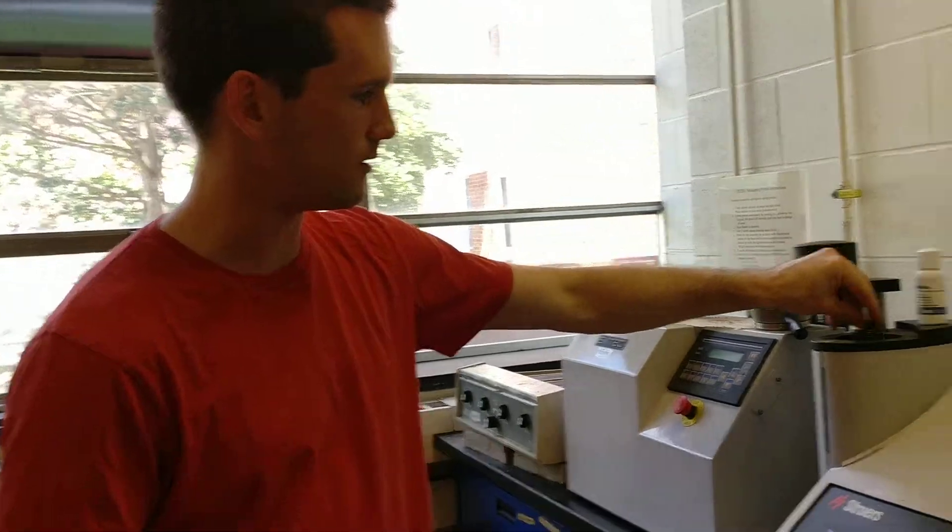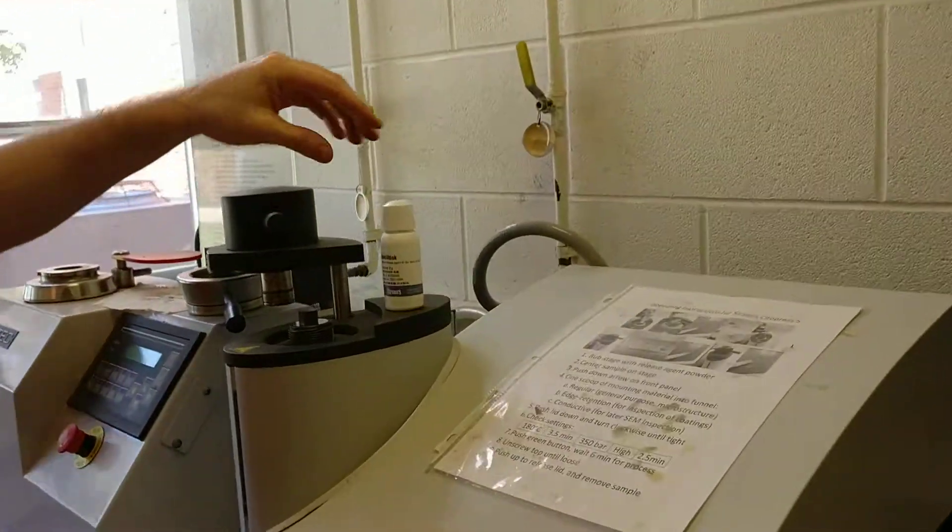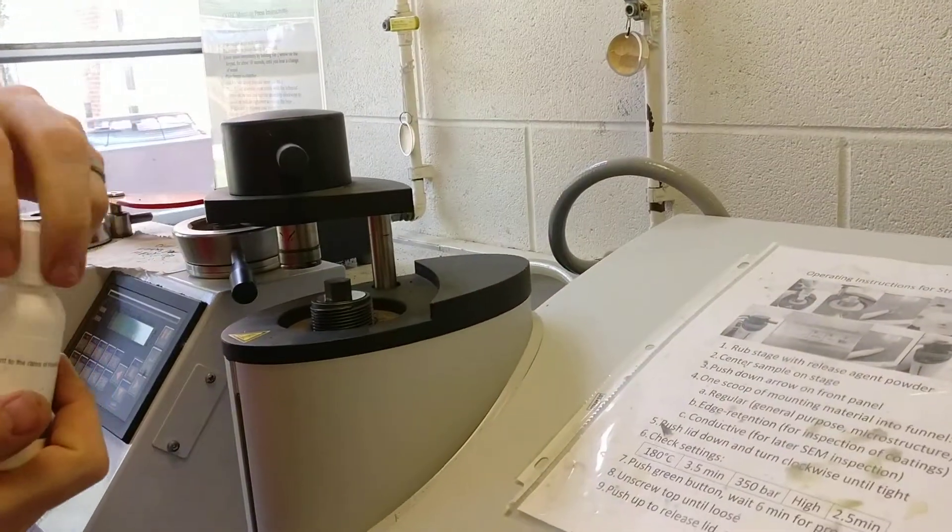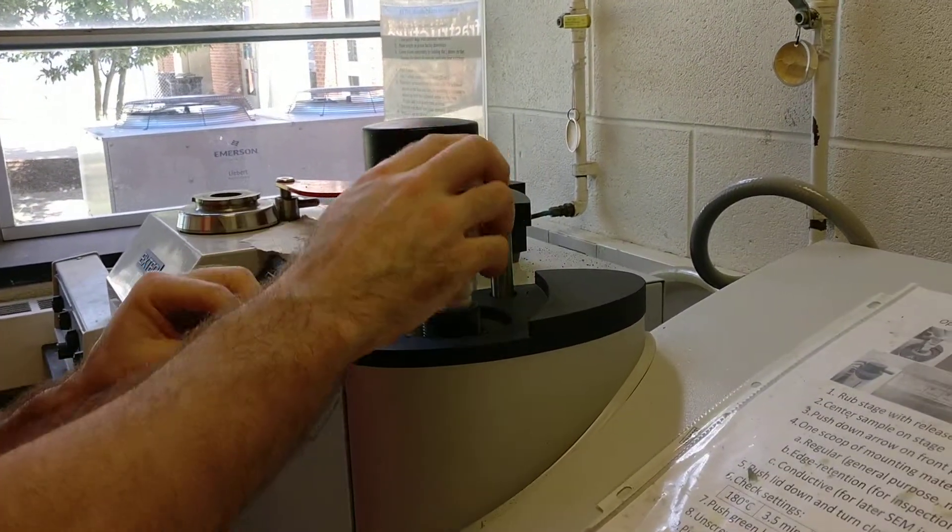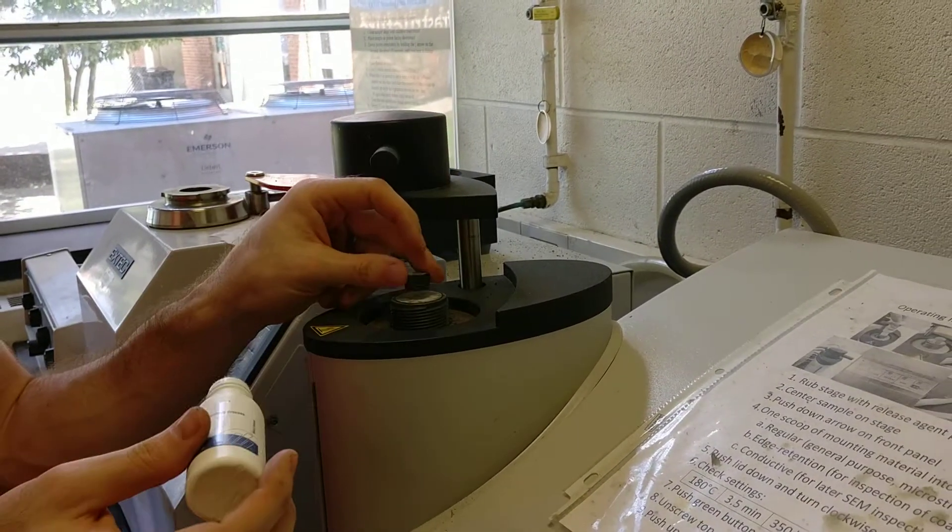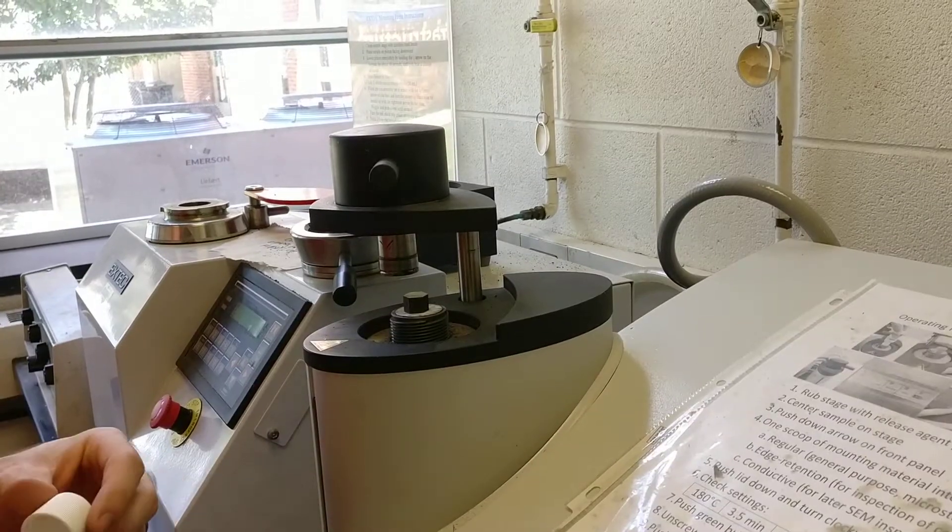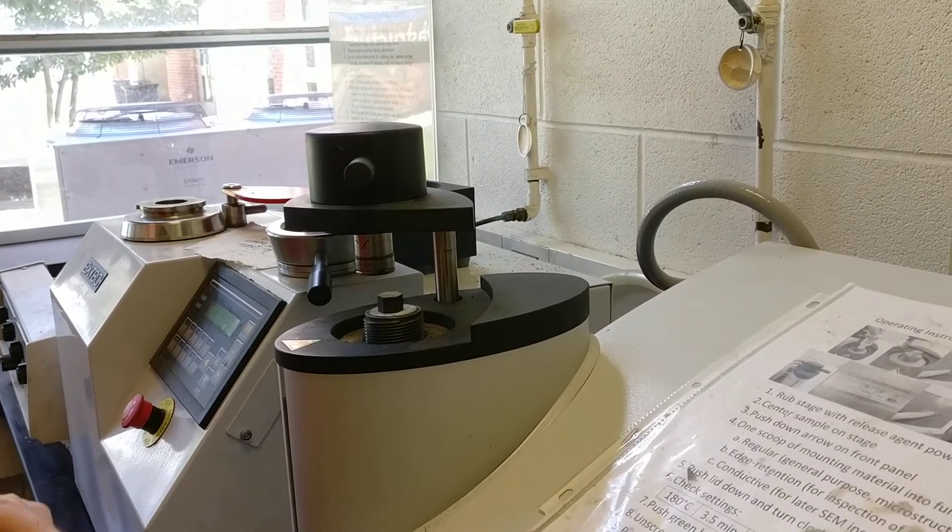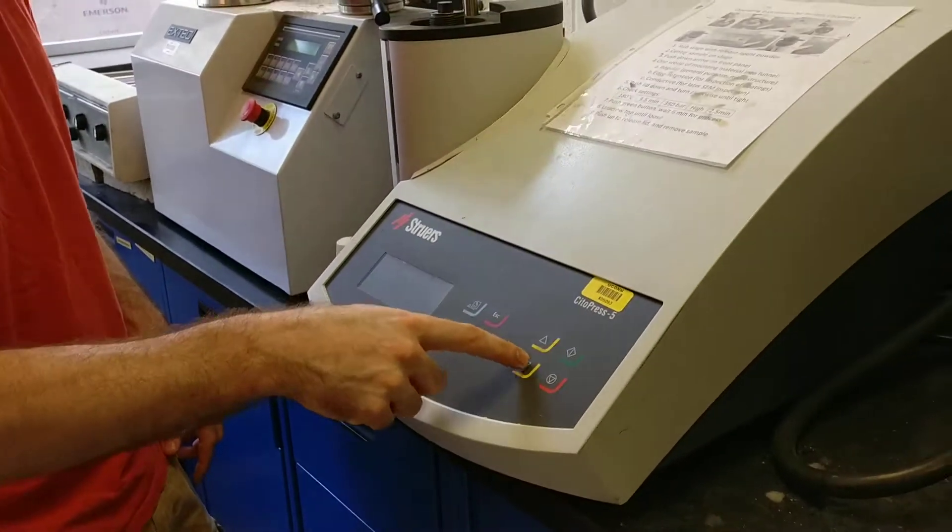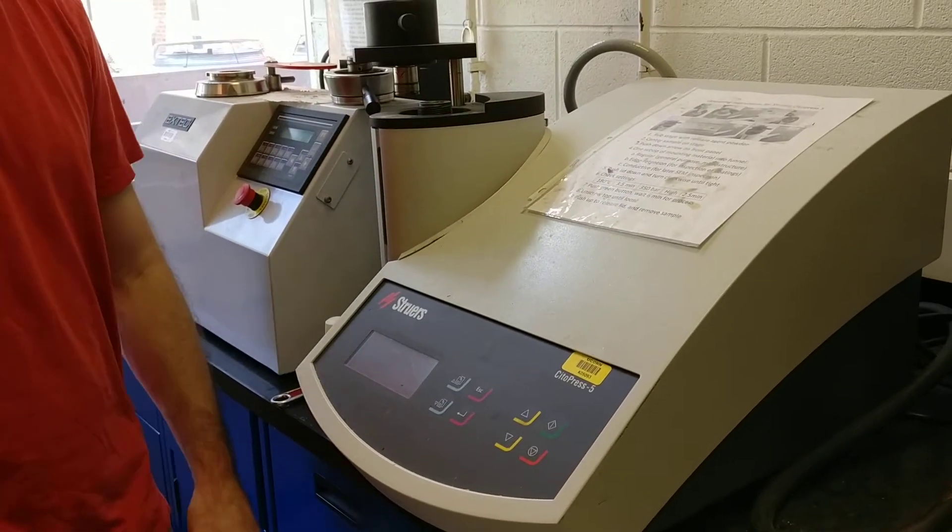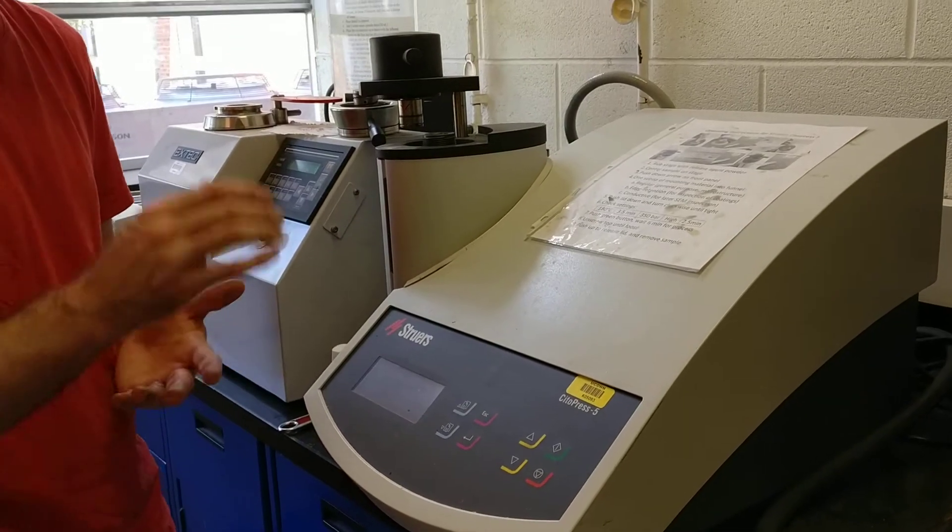Next you want to mount the flat side down onto this sheet. There's this anti-stick stuff that's kind of like a talc powder so you can put that on before you put your piece on to get it to release easier. The next thing you want to do is touch the down arrow here. That will lower your piece with hydraulics.